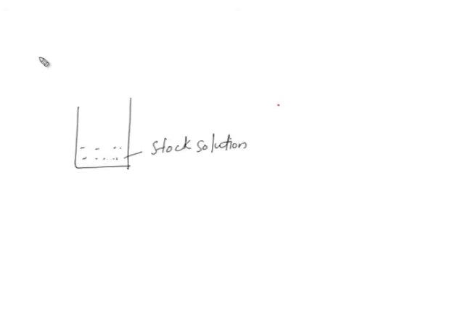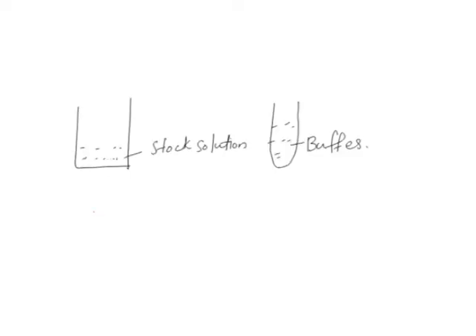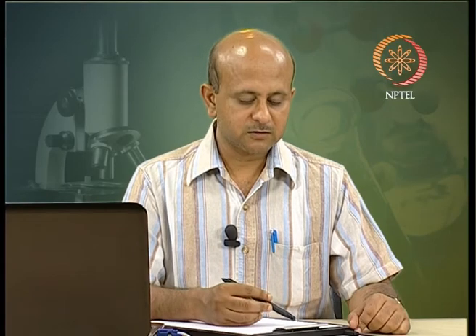Like for example, you want to make 10% gel. So, what you will do is, there is the stock solution of acrylamide, then there will be buffers. You have to take these buffers, which could be running buffer like electrode buffer, and could be gel buffers where you have to make the gel, and these buffers we will be discussing later on. There could be a condition like stacking gel and resolving gel, or it will be a continuous system where a single gel is utilized. So, as per your calculations, say you are making 10% acrylamide gel, you will take the buffer, take a certain amount from the stock acrylamide solution, and mix so that the final concentration is 10%. All right.